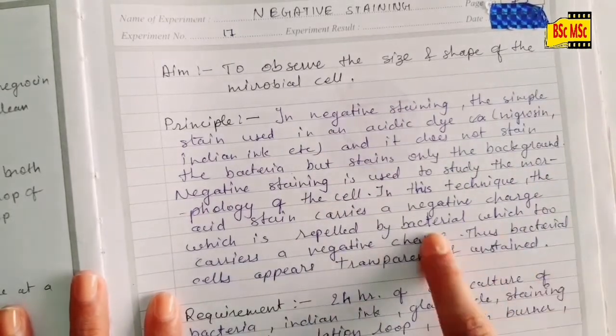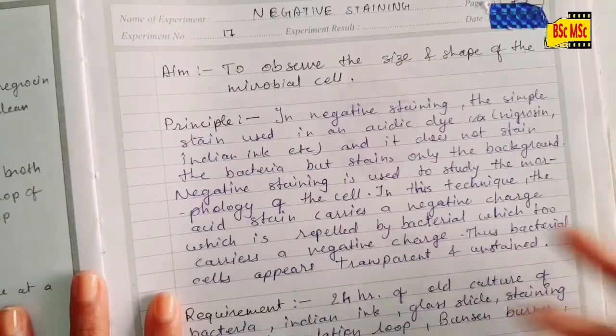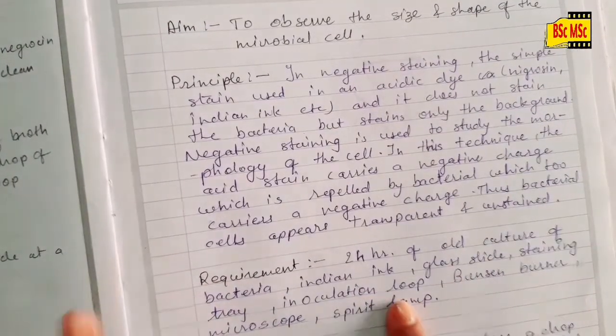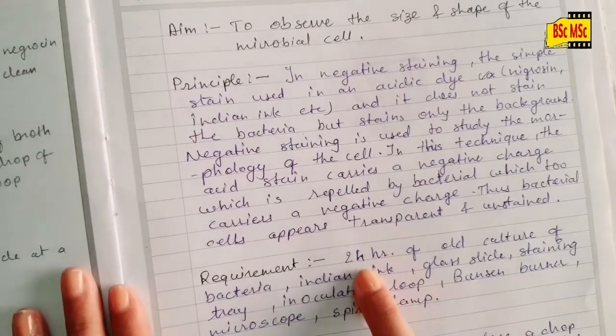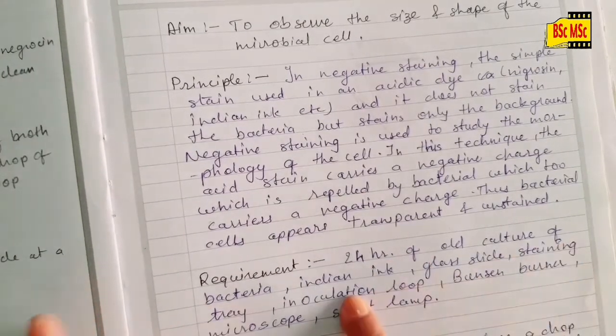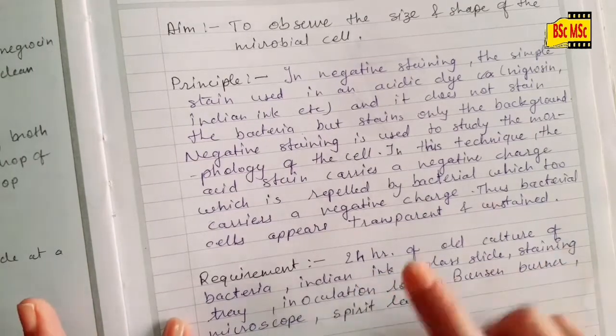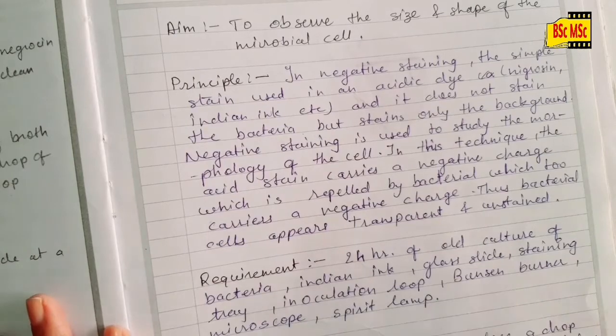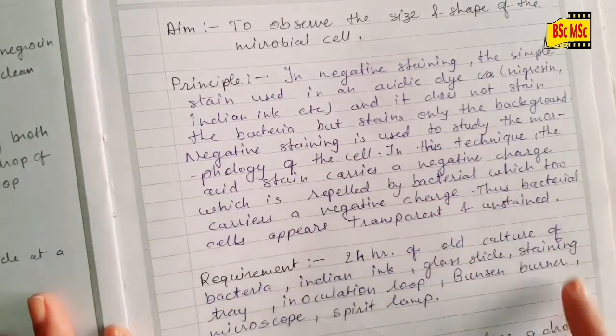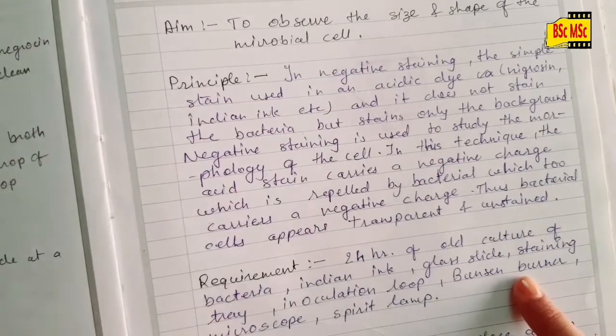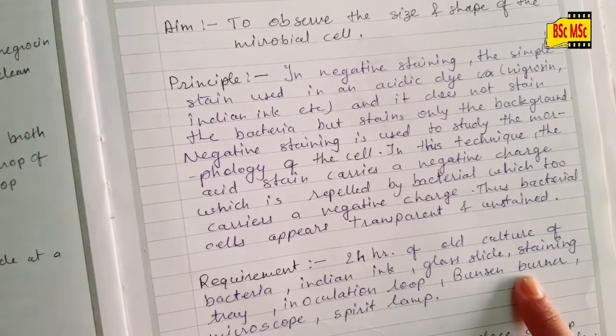Let's start with the procedure. The requirements: what you need for the experiment is 24-hour-old culture of bacteria, Indian ink or negrosine dye, two clean glass slides, staining tray, inoculating loop, Bunsen burner, microscope, and a spirit lamp.